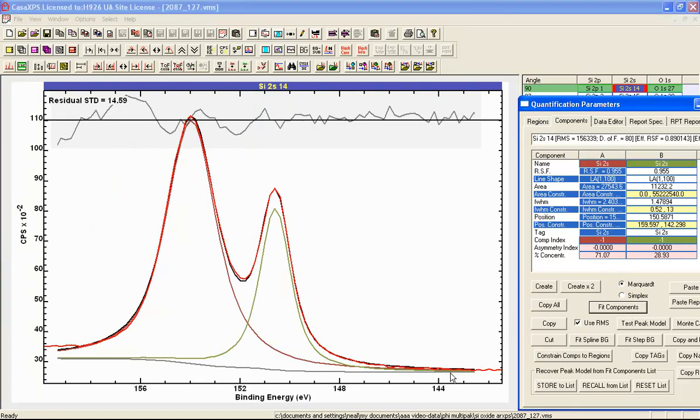We can see that it is possible to produce a line shape and a background that reproduces the data reasonably well, provided we are willing to offset the background and use a Voigt function for the line shape that has a predominantly Lorentzian characteristic. And the use of a Voigt function is appropriate for both of these peaks, provided we're willing to offset the background from the data itself.